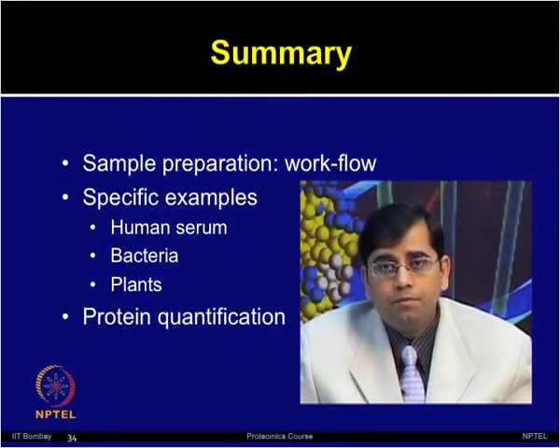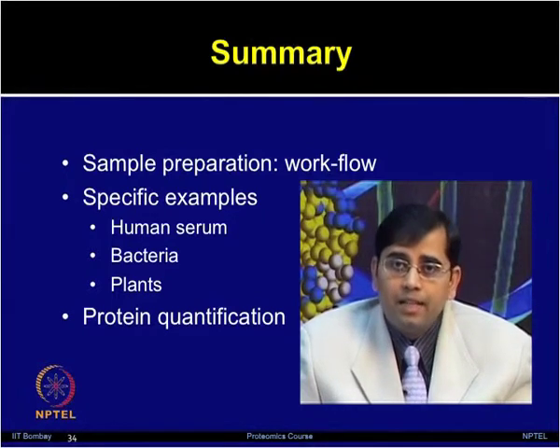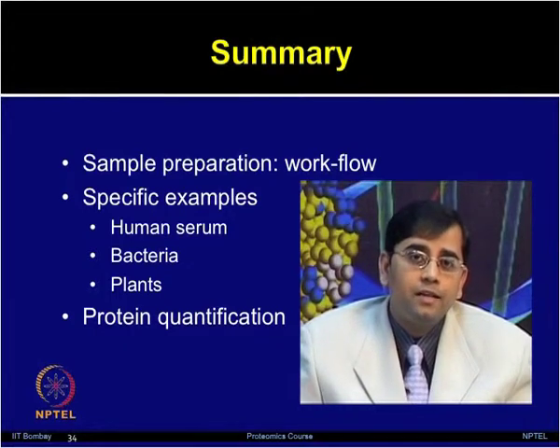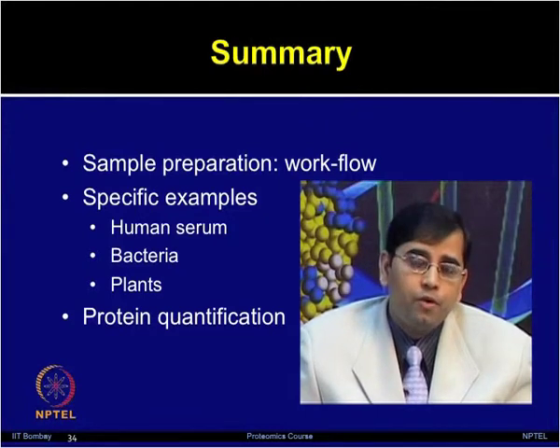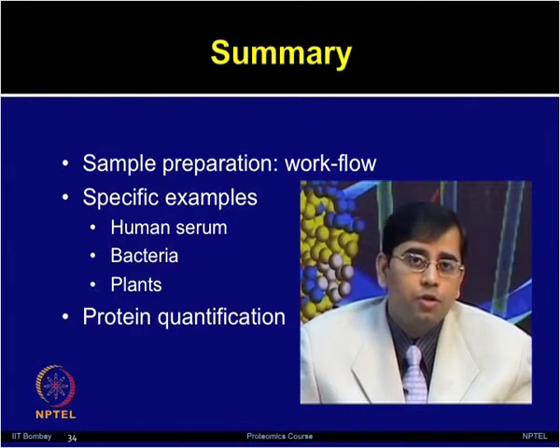We talked about how to pre-fractionate the samples, then how to precipitate the samples, how to remove the interfering substances, and then we moved on to specific examples. We discussed in more detail different criteria used for analysis of clinical samples, and then we talked about how to analyze human serum samples.